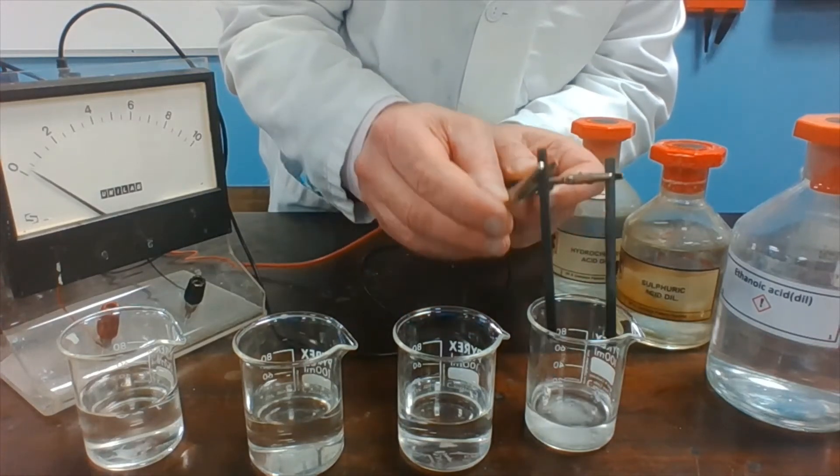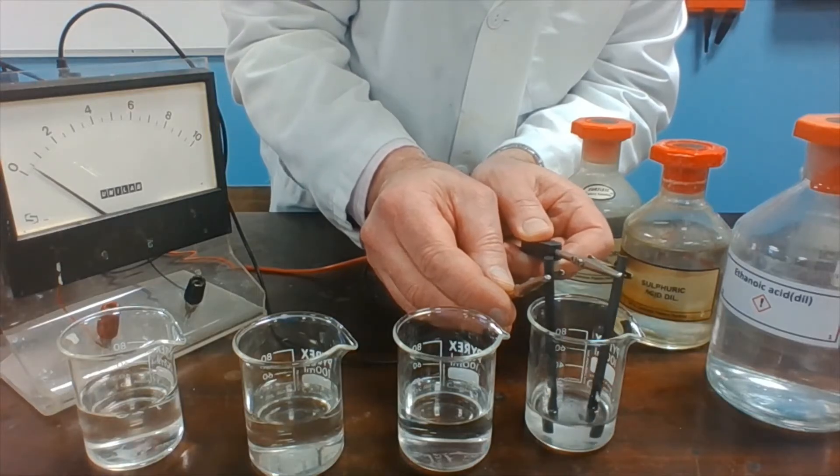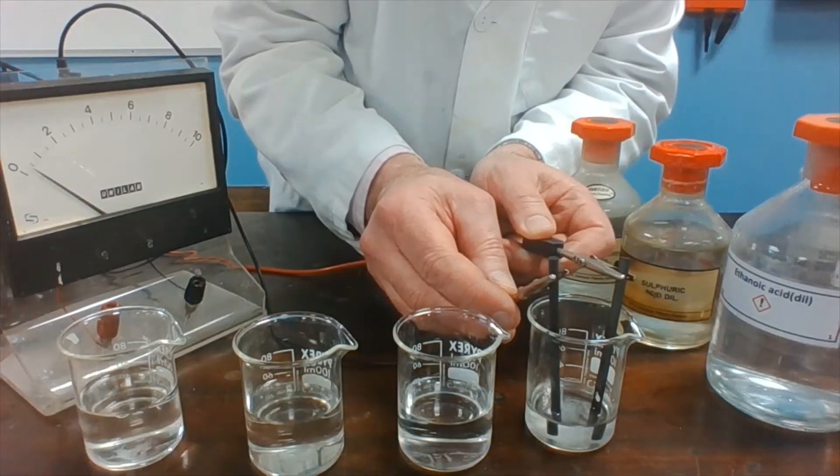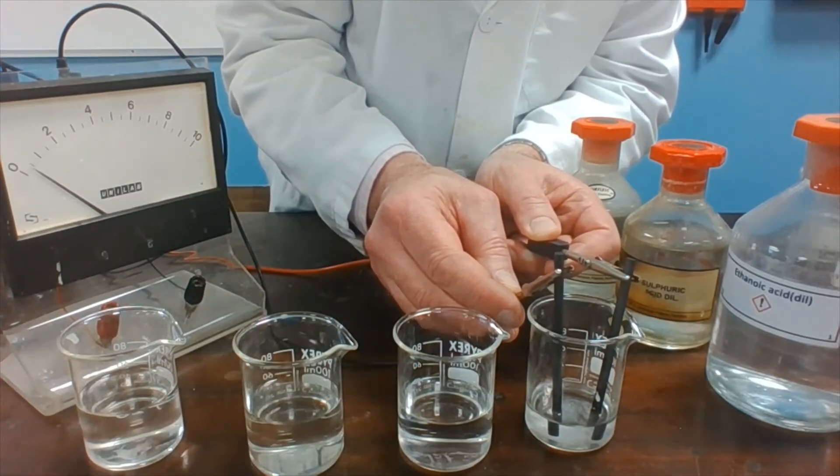You might see a very slight movement on the ammeter. So it is conducting very, very slightly. And again, you might just begin to see some bubbles of gas coming off at the electrodes.